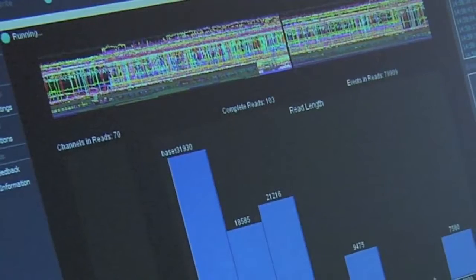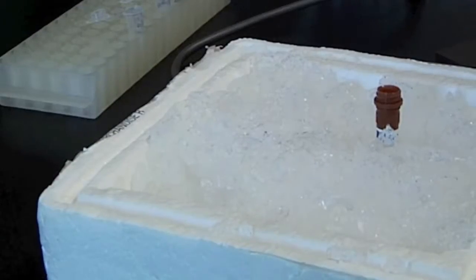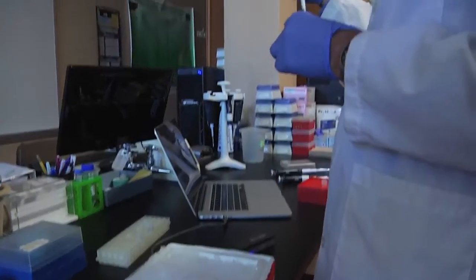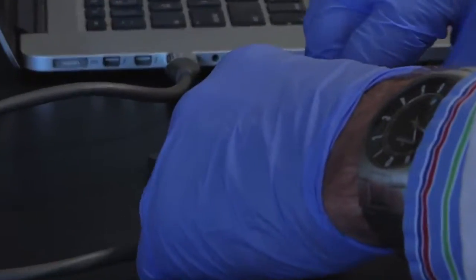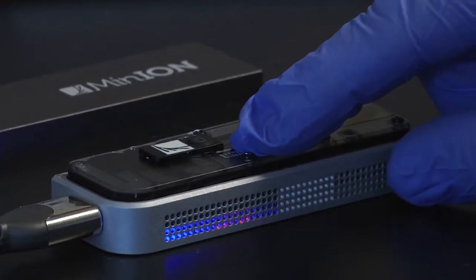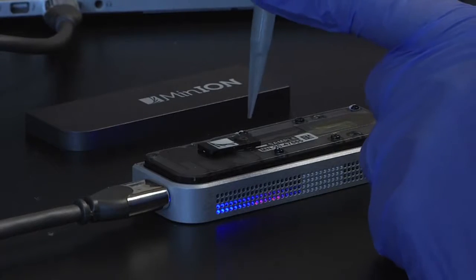For NMSU to be participating and recognized as a valuable contributor to this process is quite an honor. The big advantage of it is that it's much cheaper than existing instruments, and it's therefore much more accessible to a much wider variety of laboratory settings. Because it is so small and portable, you can imagine this being in a typical medical clinic. So that opens up a lot of medical applications overseas, in Africa, in Asia and so forth, in regions of the world where medical clinics don't generally have access to such highly sophisticated technology, this is simple enough that it could be deployed.